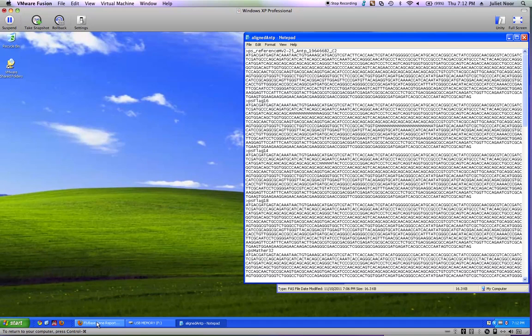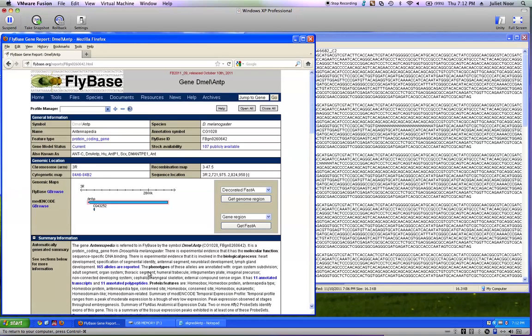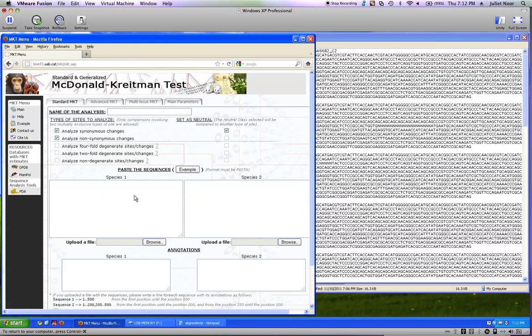The next thing I need is the website we'll use to calculate the McDonald-Kreitman test for us, and that is at mkt.uab.es. The page for running the test loads right away.